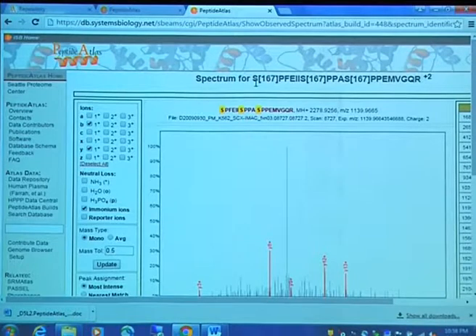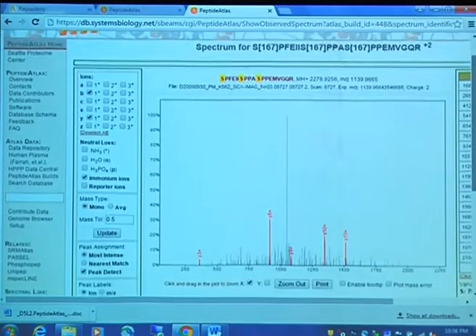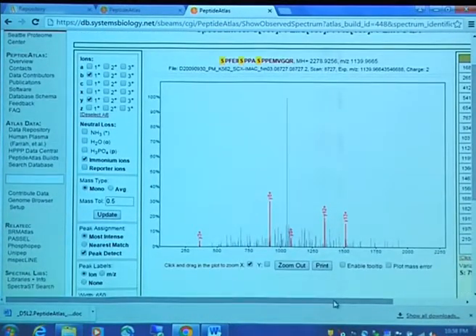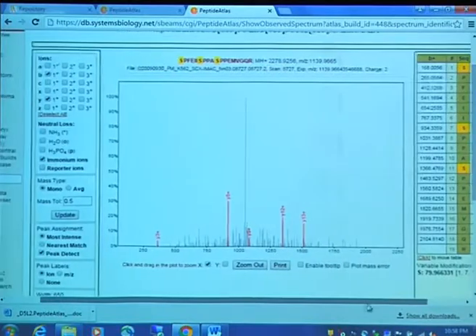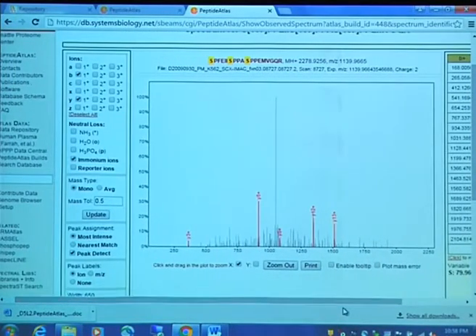This nomenclature means that, okay, in fact, this one was triply phosphorylated. So this one, the mass of the parent ion varied by 240 from the original. And in this case, it looks like all 3 of these are phosphorylated. It's a +2 ion. And here is the spectrum. Here we have quite a number of possibles, and there's only 5 of them that are annotated. There are quite a few that aren't. So this is actually a pretty underwhelming spectrum.